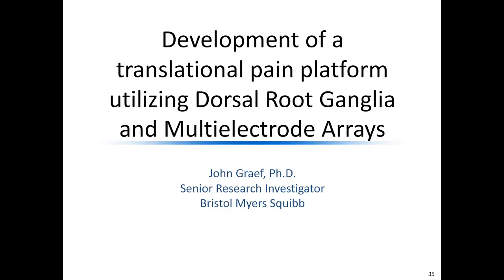All right. Thanks, Stacy, for that introduction. And thank you, Axion and LabRoots, for organizing this webinar. So today, for the last part of this webinar, I want to focus on how we've been using the MEA system from Axion to try to create a pain-in-a-dish model using embryonic rat dorsal root ganglion neurons.